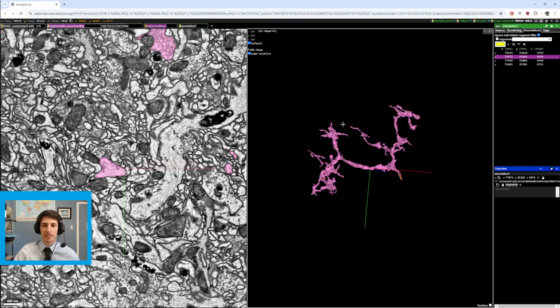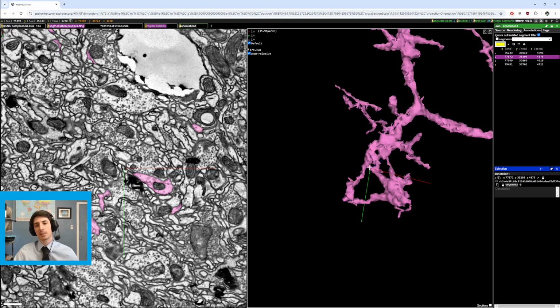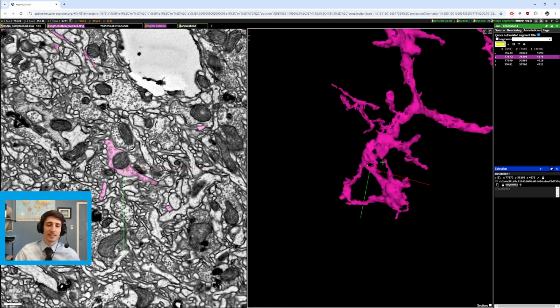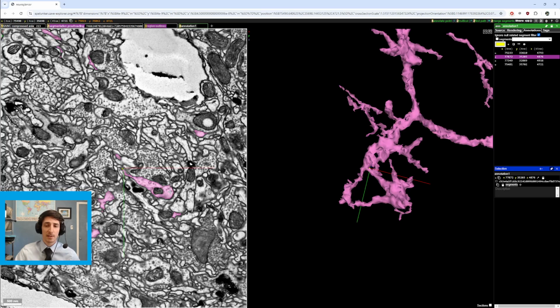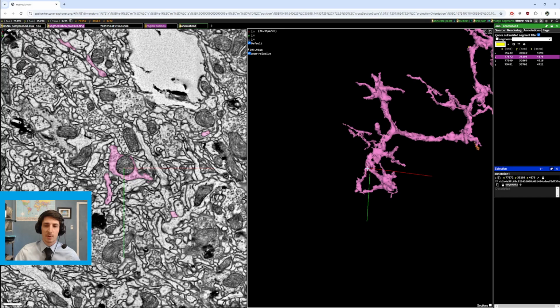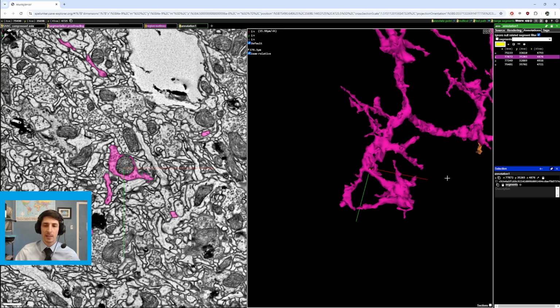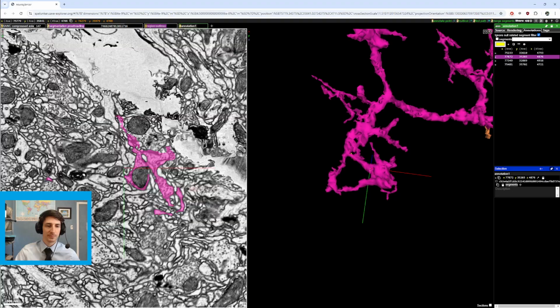But that's okay, we still have two more, and it was actually the last place I checked that was the continuation, which makes sense because you find the continuation in the last place that you look. This area was interesting to me because this is quite a thick branch, but the theme of this neuron is short, stockier branches.